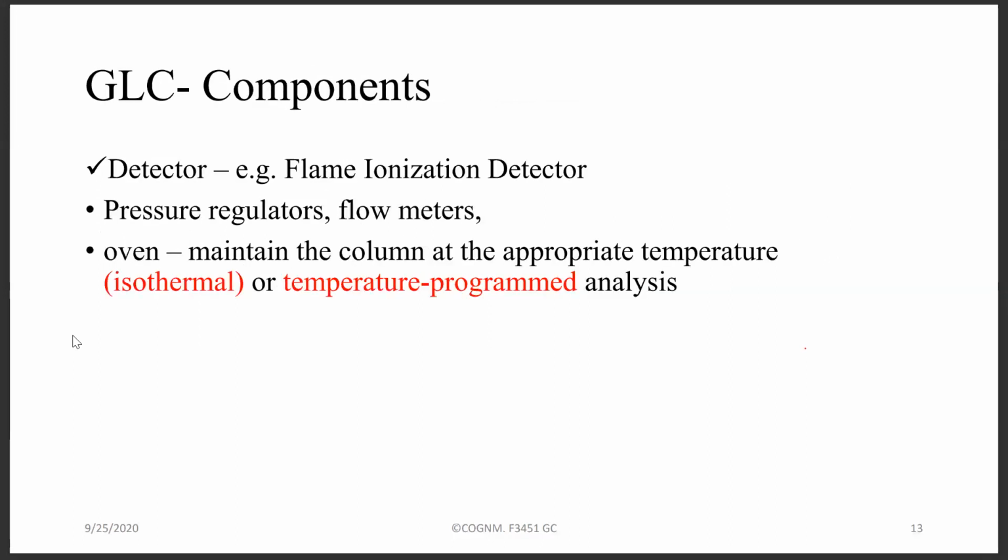So I explained the flow, the pressure and filters. From the beginning, here we have induced pressure from the gas, while in column chromatography, atmospheric pressure is being used.